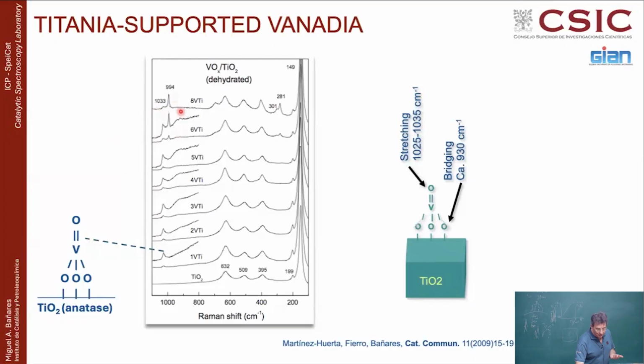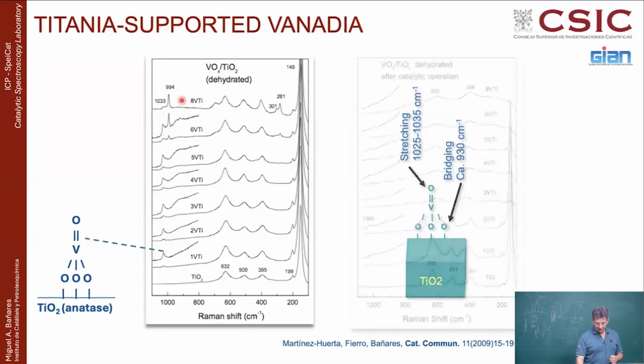So we have put very few more, from 6 to 8 weight percent. So you have the minimum expression of a vanadium pentoxide crystal, and you can already see it pretty nicely, a very sharp, elegant peak, because Raman is extremely sensitive. You are at a moment that X-ray will never realize that there were vanadium pentoxide crystals there, but you see them with Raman. But the interesting thing here is not really what happens with vanadium pentoxide, but this is important because I wanted to highlight how important Raman is to detect molecular structures at very low loading. So this is the fresh catalyst before reaction.